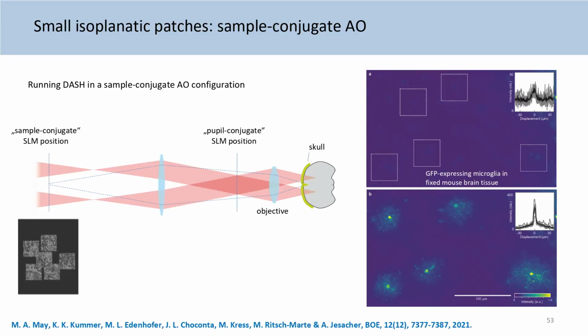So I could imagine having an AOM moving my beams around very quickly between the corrected points. And this is also not the limit, right? I guess you can upscale that maybe to 50 spots, maybe 100.